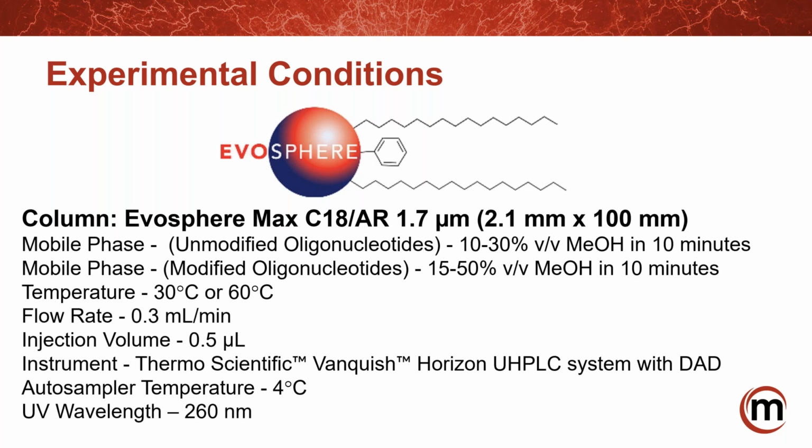It just happened that the hydrophobicity component is a real benefit, because the backbone of the oligo itself has so much hydrophobic nature that the differences in how much pi-pi character is hanging out there in the mobile phase that can impact the stationary phase are minor.